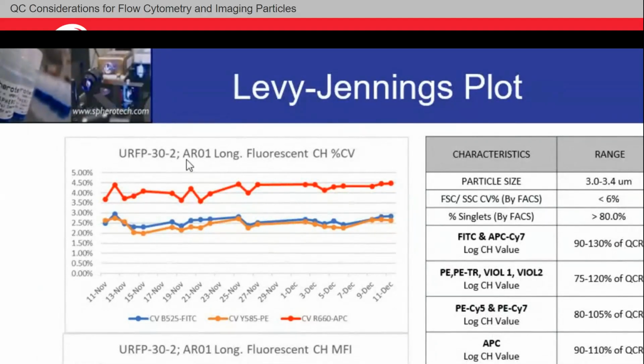If you get lot AR01, previously, historically, you had lot AM01, AL01. After a year or two, or a year, maybe 6 months, you completed your bottle, you get a new lot, AR01, AS01. Is there a chance that that new bottle is different from the previous one? Yes.